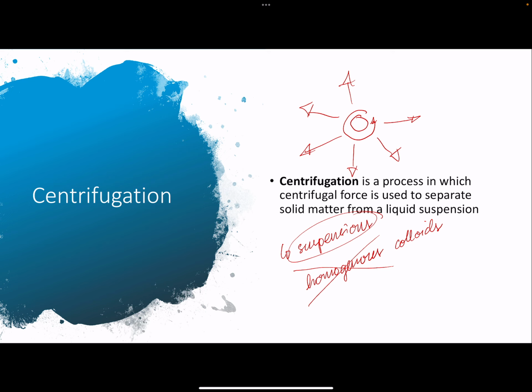Usually inside the laboratory, we reach up to 3,600 RPM. These are rotations per minute, or to put it in simpler terms, this is the speed at which the centrifuge spins. In the laboratory, this is particularly useful for blood. It's also used for urine and for CSF. Cerebrospinal fluid is the sample representative of our nervous system. Among other things.